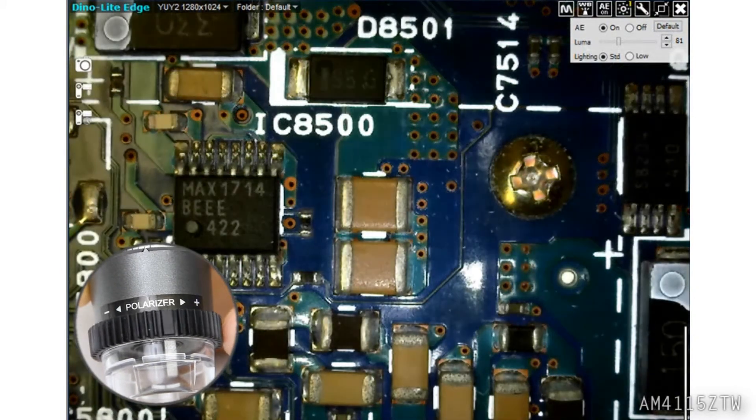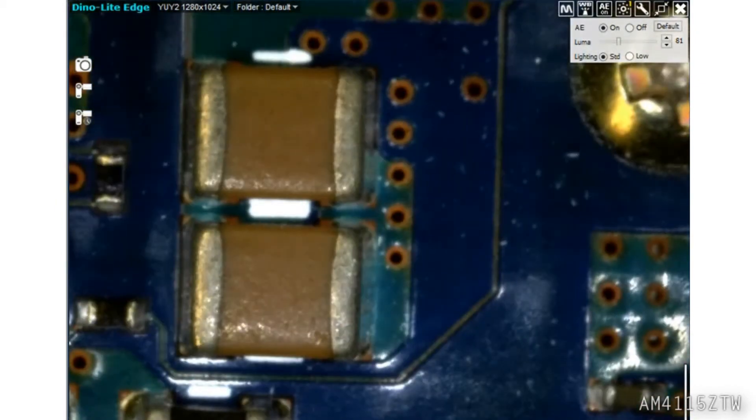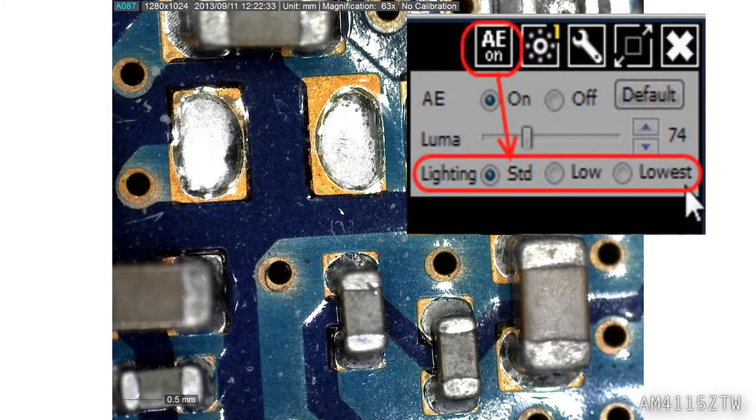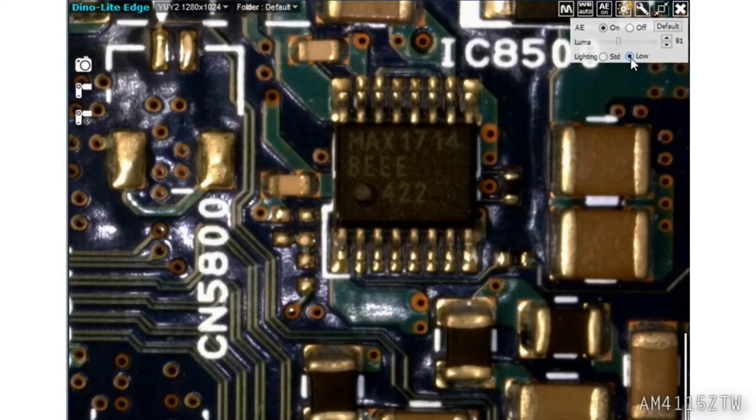This model also has a built-on polarizer which is great for reducing or eliminating glare from reflective surfaces. The auto exposure button has a drop-down menu with useful imaging solutions. Here you can see the live effects of those tools.